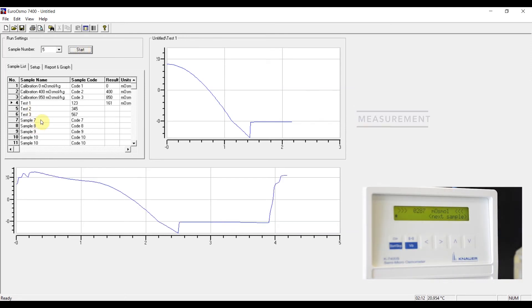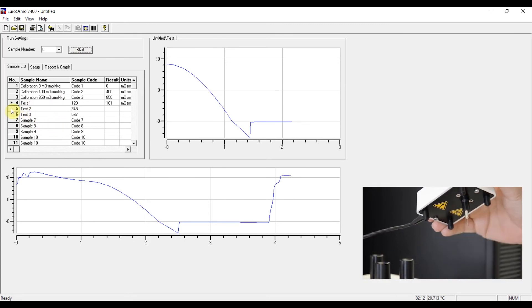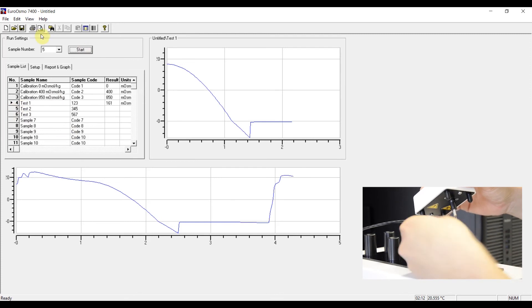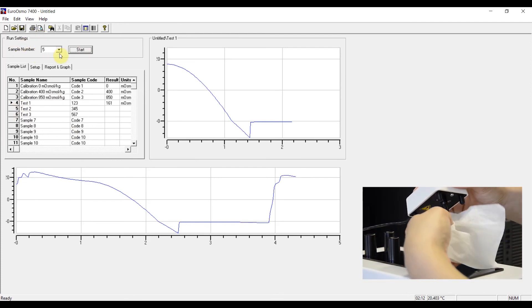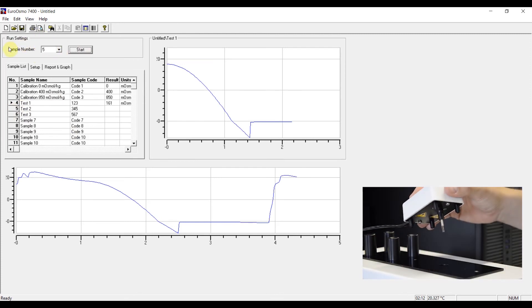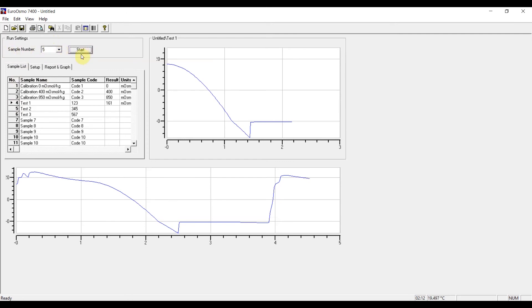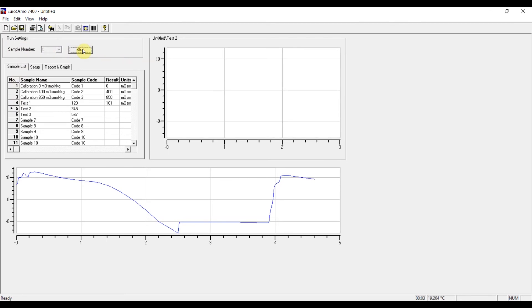Now we want to measure test sample two, which is sample number five. And since sample number four was measured successfully, sample number five was already inserted automatically over here. So now we can just press start and the next measurement will begin.